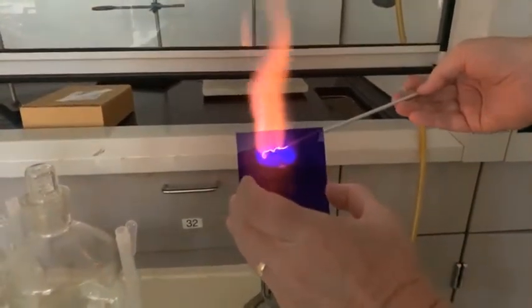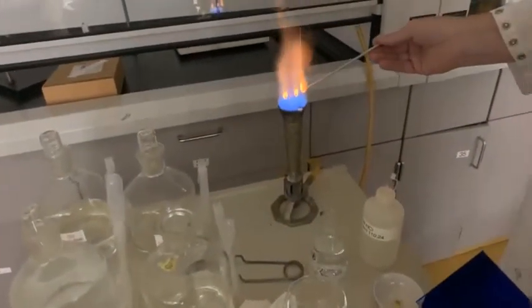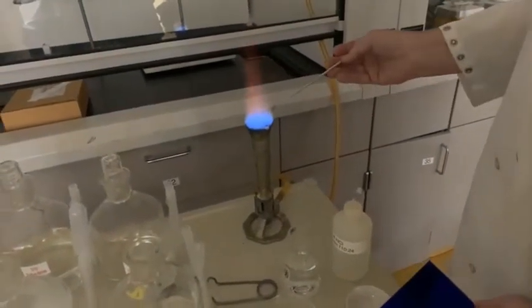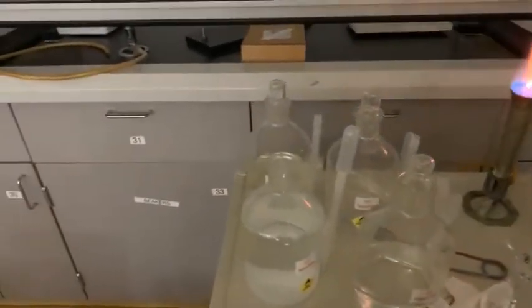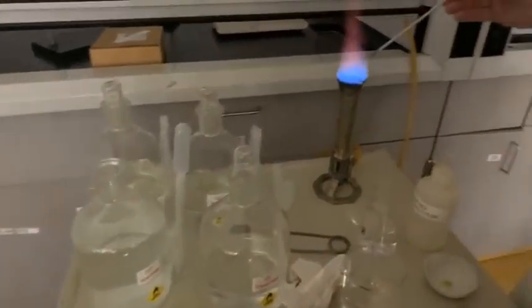Okay. All right, I now need to quickly clean the loop. I'm going to use concentrated nitric acid and pure water so we can perform our next test. So our second test is to show you the flame. Whoops, the potassium's still there. Let's get rid of it.